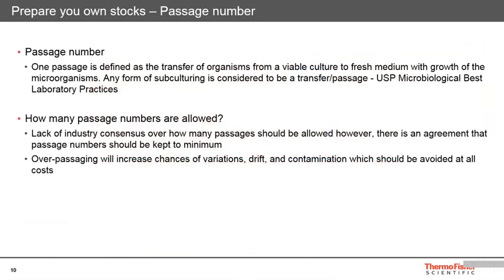Passage numbers. This is one of the most important terms. One passage is defined as the transfer of organisms from an established culture to a fresh medium, generally meaning transfer of organisms from one plate or slant to the other.